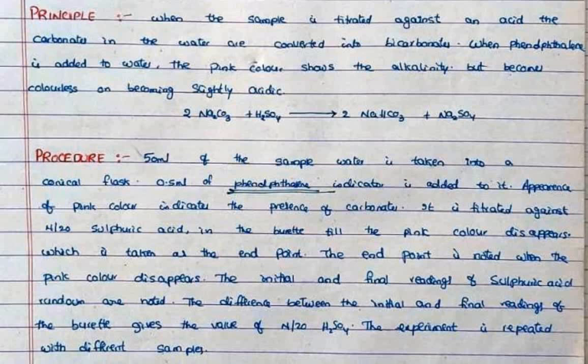Appearance of pink color indicates the presence of carbonates.